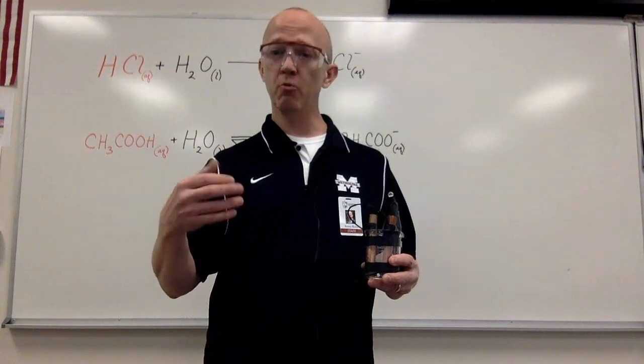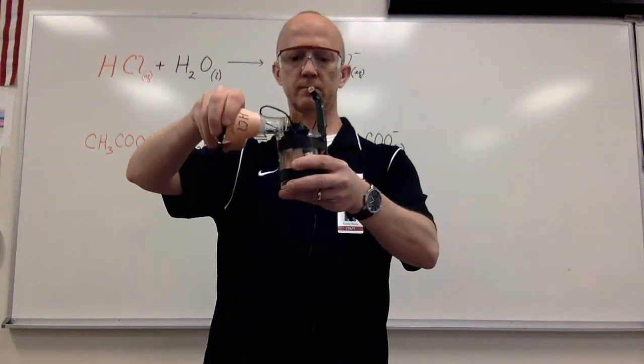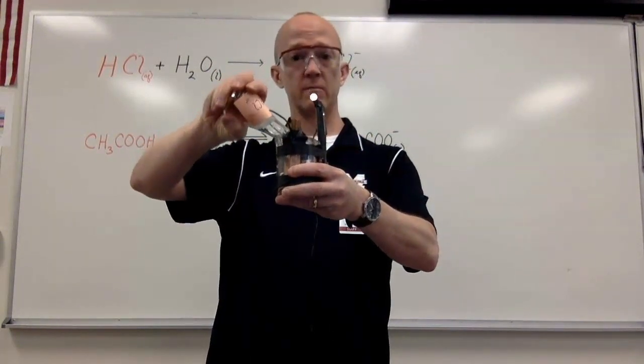So because of its poor showing, we can see that acetic acid, even in its concentrated state, is still known as a weak acid. Let's compare that to hydrochloric acid, which is known as being a strong acid. Here we go. Hydrochloric acid, and wow, it's easy to see the light in this case. The electrons are having no trouble getting from one electrode to the other. So there's a great deal of electrolytic activity in the hydrochloric acid, and yes, it is considered a strong acid.